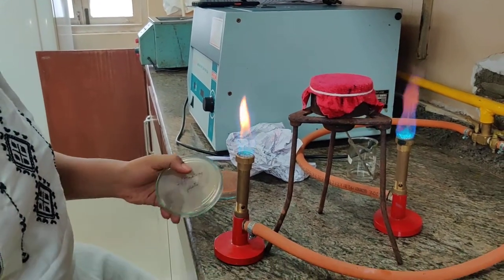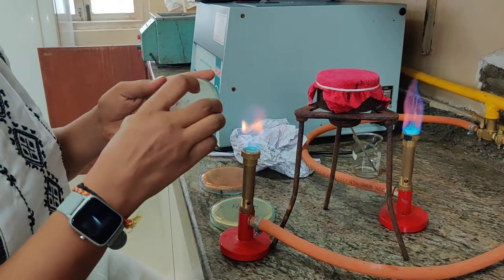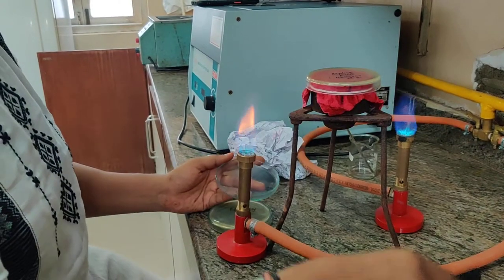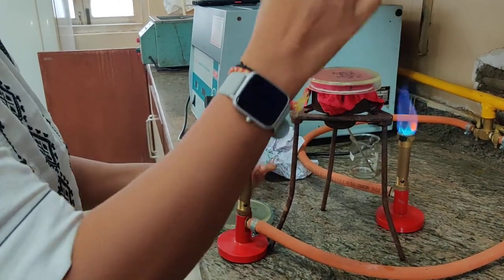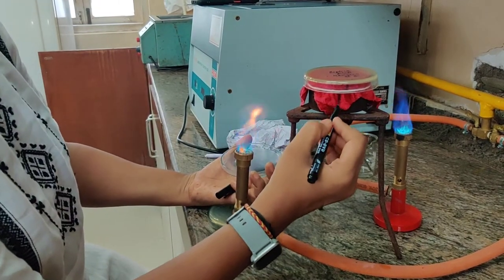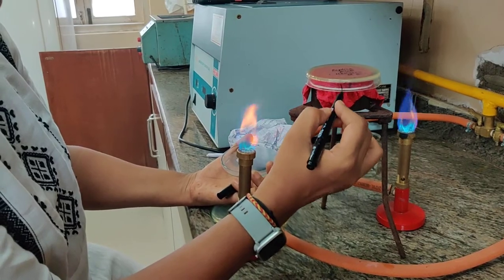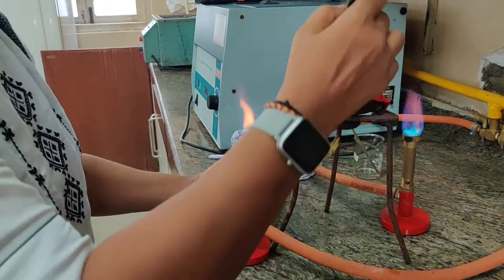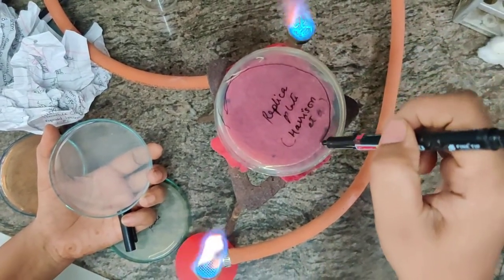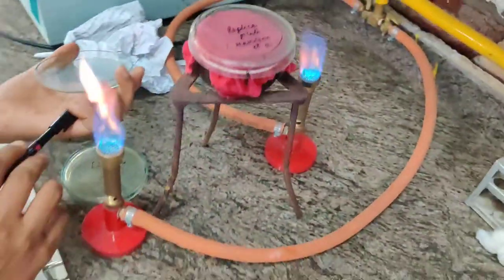That is your day two incubation. So first we take our replica plate. Now that our block is inoculated, we are going to place it here. We tap it with a marker, making two markings — first the marking that was made on the block, and coinciding with that, we make it on the replica plate. We also mark the area, because the block is not covering the entire plate, so we mark out where we have inoculated.